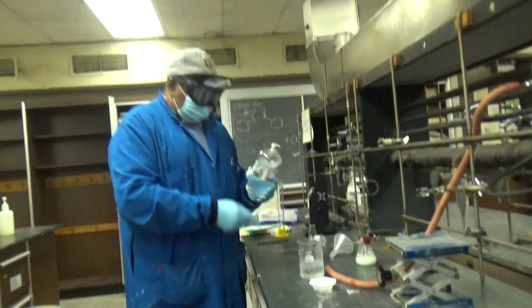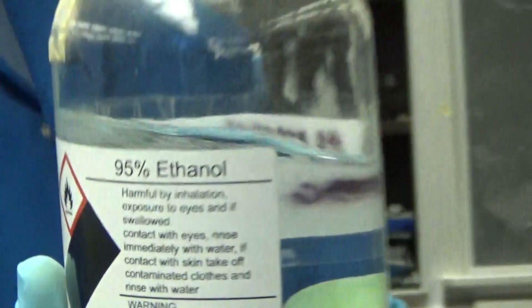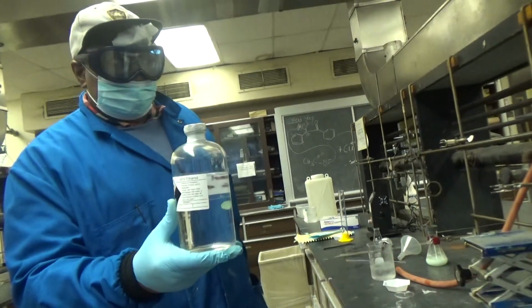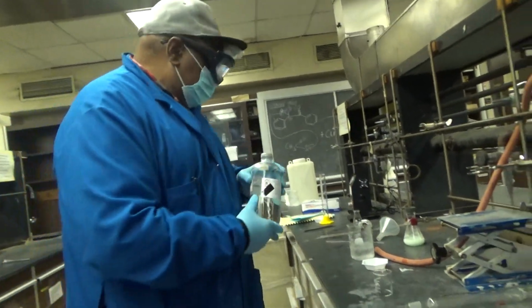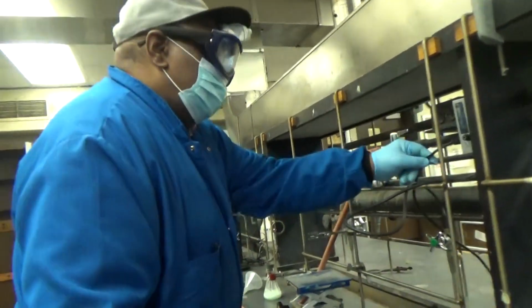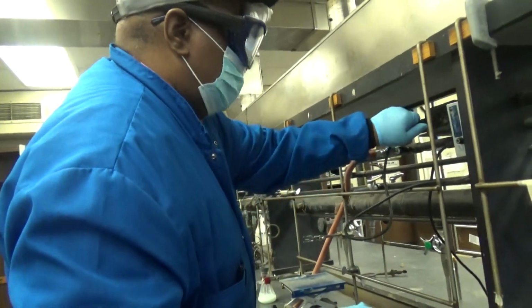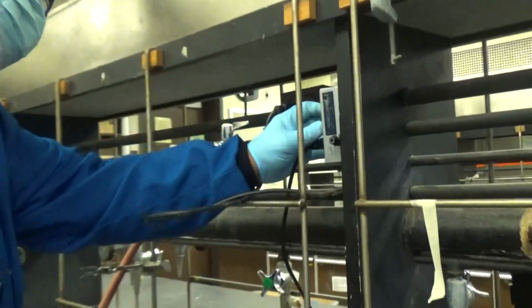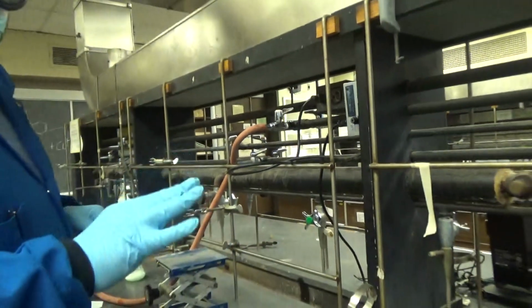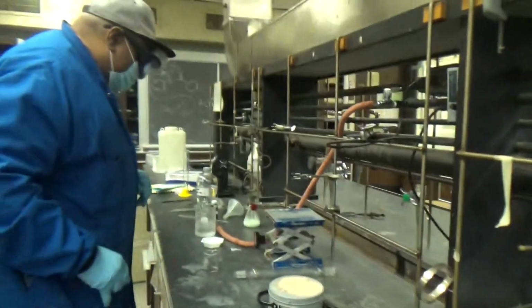The solvent you are going to use for the crystallization is some 95% ethanol. That's a good recrystallization solvent. So you're going to purify it by recrystallization. And that's why you have the hot bath ready again, because you're going to heat it up. This time, don't touch it. It's very hot.